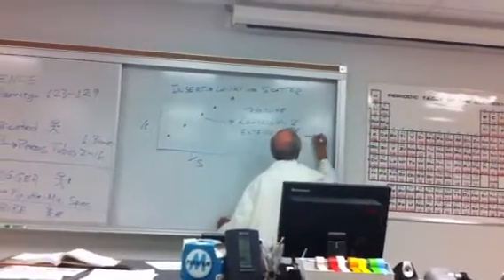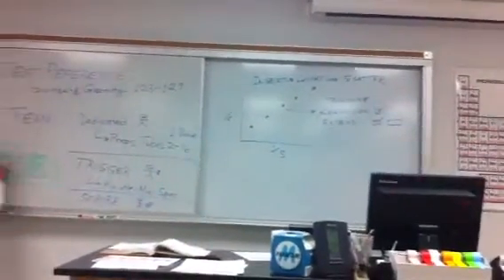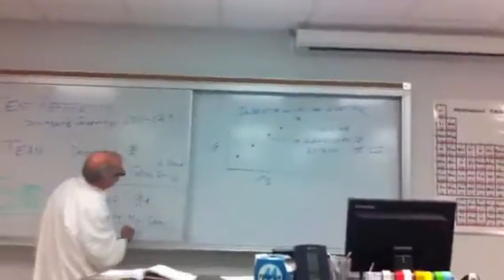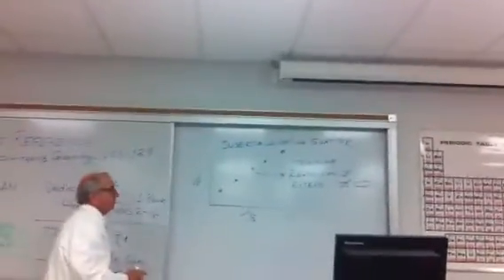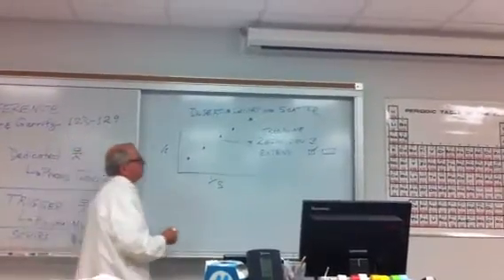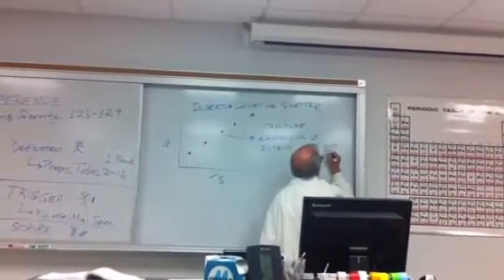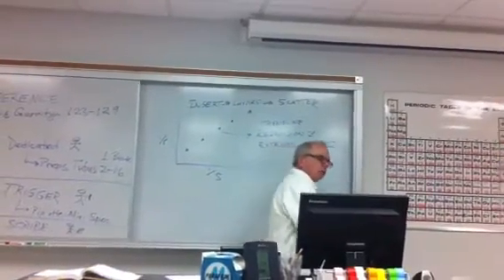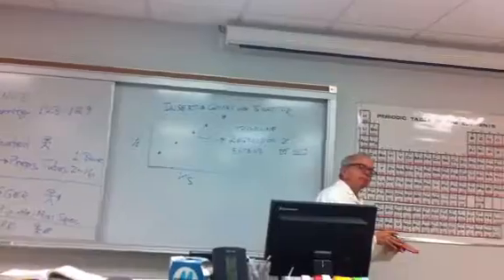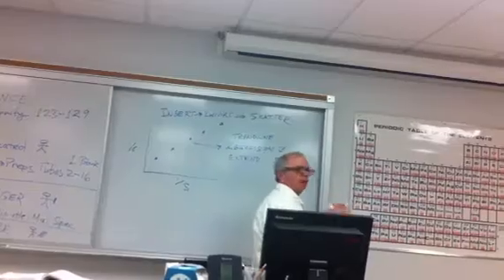Well, go back. These numbers are what? See that? It goes from inverse is 0.4 to, what was the inverse? The inverse of that is about 2.5. So go back, let's say 4. So in other words, it'll ask you, do you want us to extend it or project? Now, I forget what they're called, project, extrapolate, extend, and negative. Go in the negative direction and just say 4 back. Experiment around. You'll see what I mean.